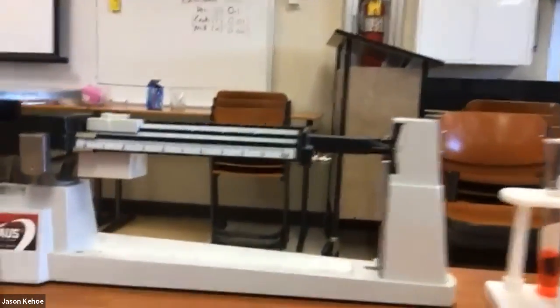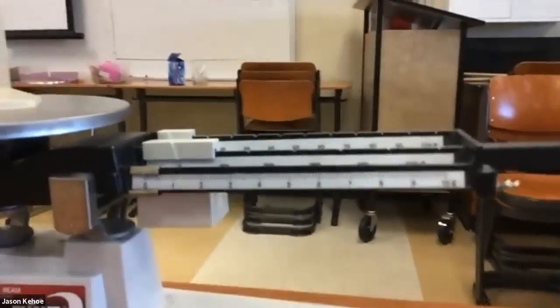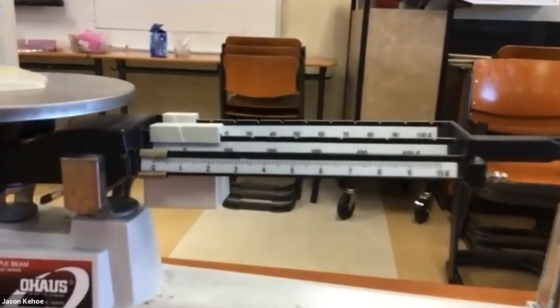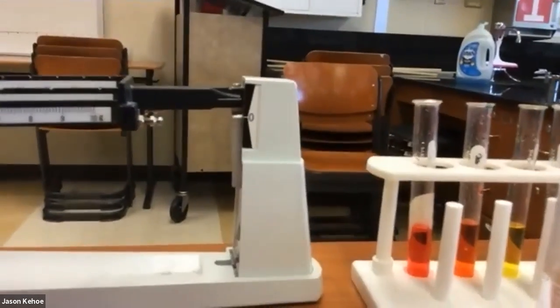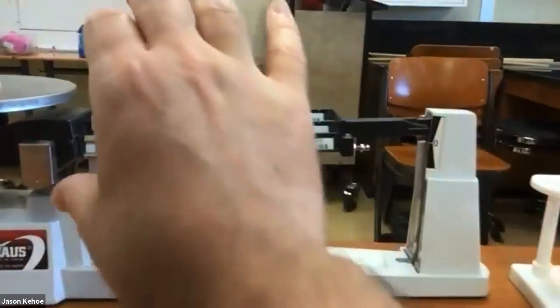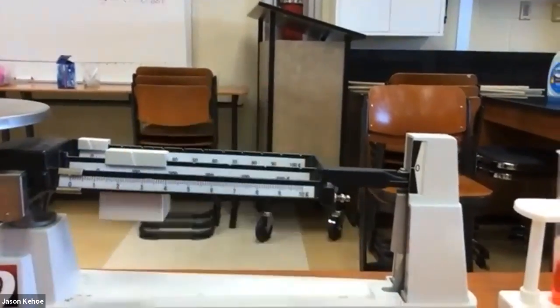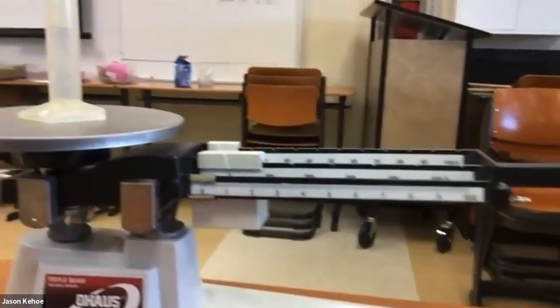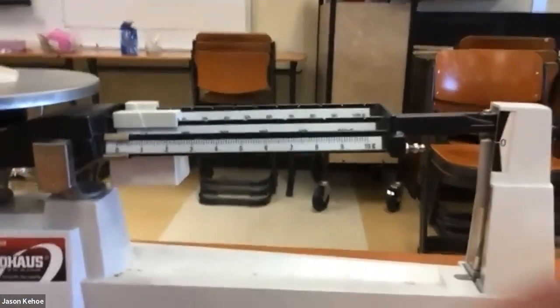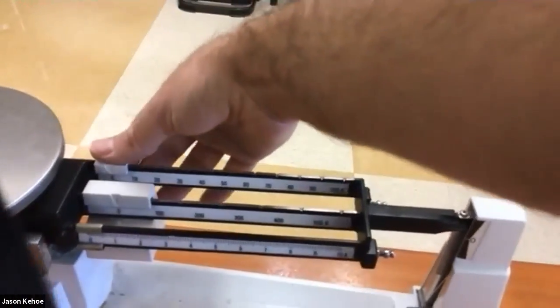All right, so the first item says small graduated cylinder. And if you recall, the way we do this, we move one mass at a time, forward one notch at a time. So see how the arrow's pointing up right now? We move them forward, starting with the hundreds place, one notch at a time until it points down, and we move it back one. So that tells us that this item, because it popped down immediately, is between 100 and 0 grams. Now, we do the tens place.